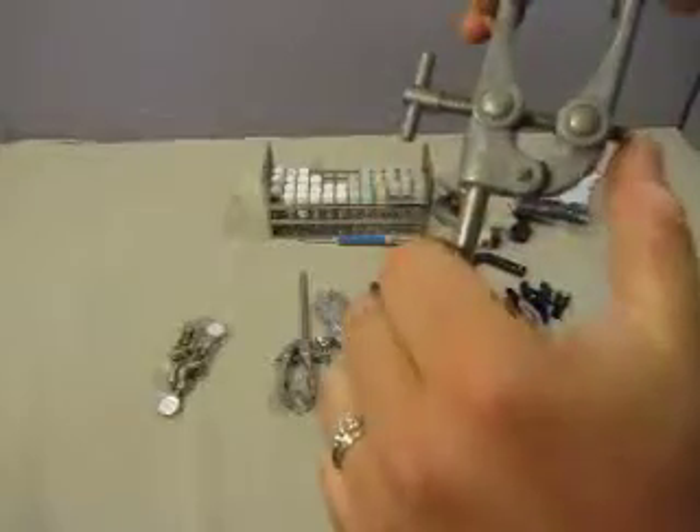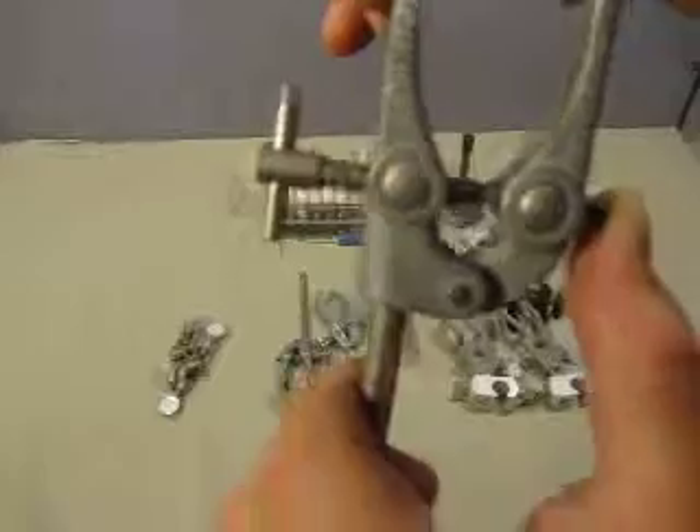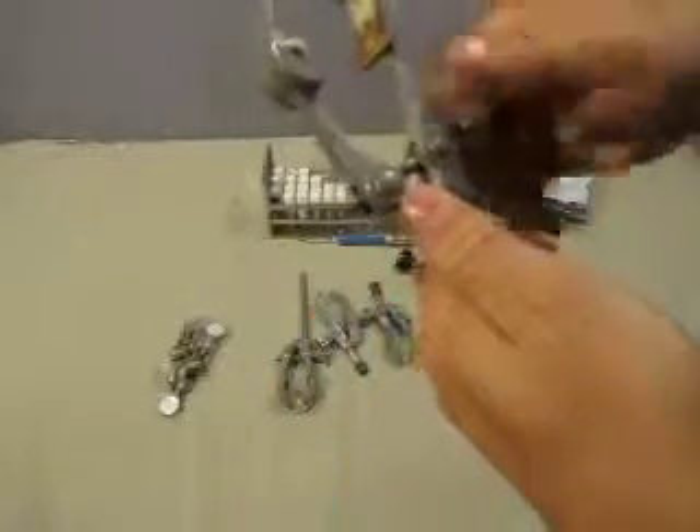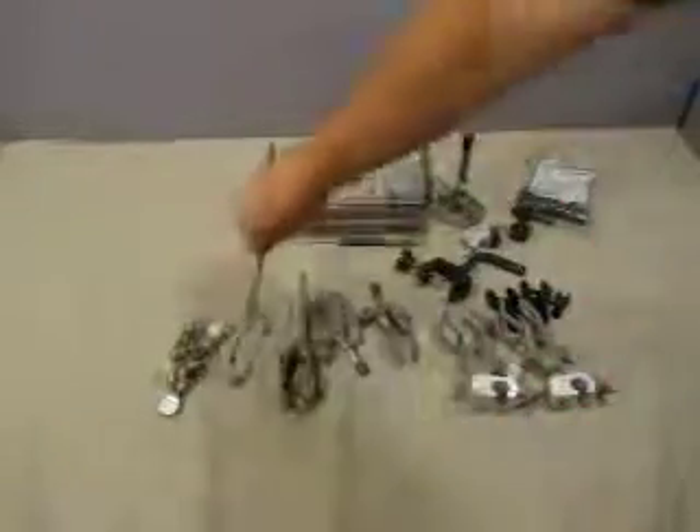Oh, I say that and it's not — this one is Technico, T-E-C-H-N-I-C-O. It's kind of like a little claw test tube holder or something. We've got two of those.